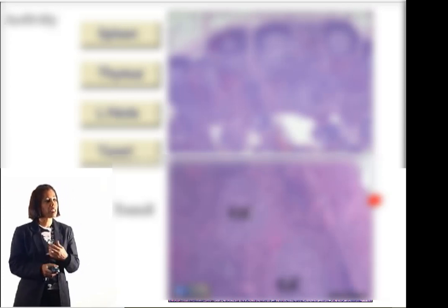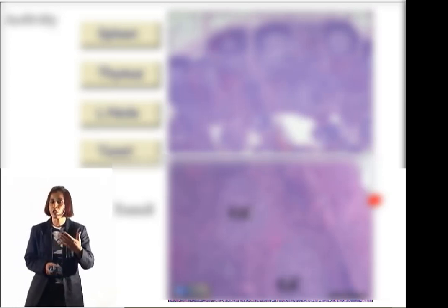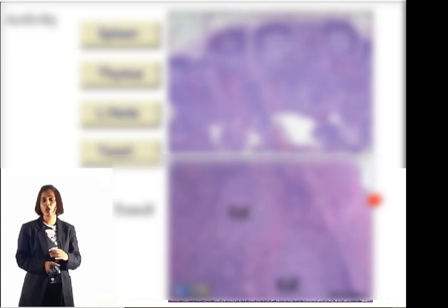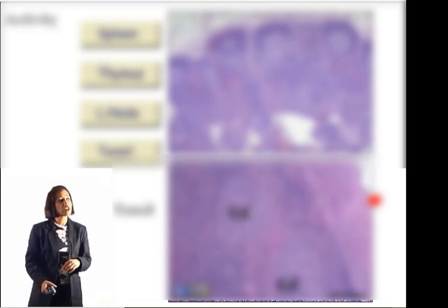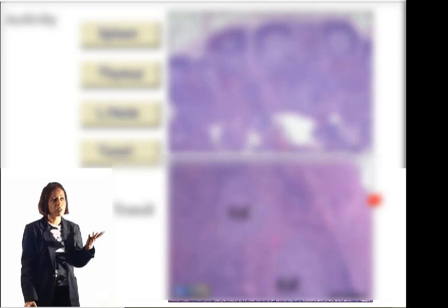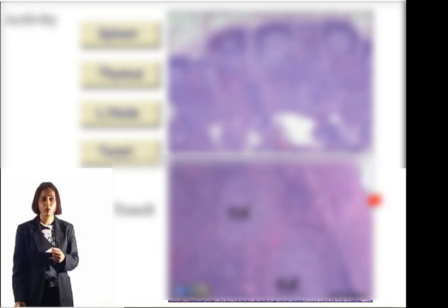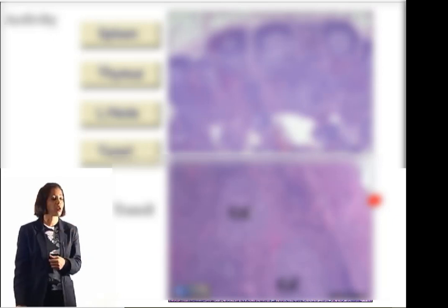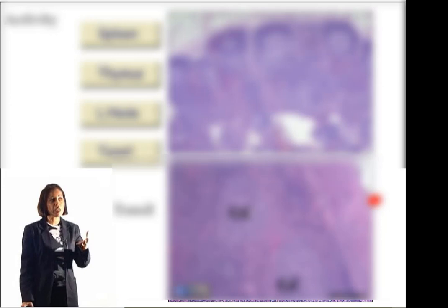Now that finishes this video, and the purpose of doing these videos, and you'll have a series of them for all the histology that you're required to do, is so that you get familiar with these images. I've only chosen certain images. I haven't included all the images from the websites that you're required to visit. You still have to look at all of them because any one of them can come in your quiz or test. But by looking at these images, you know what you're supposed to look at.